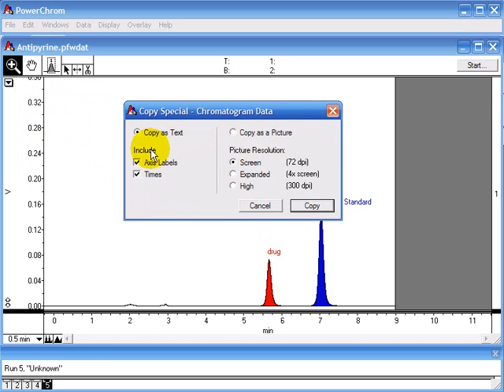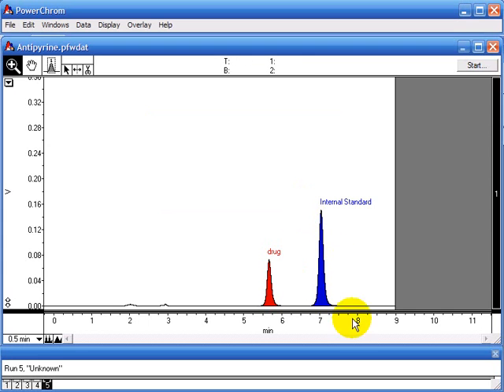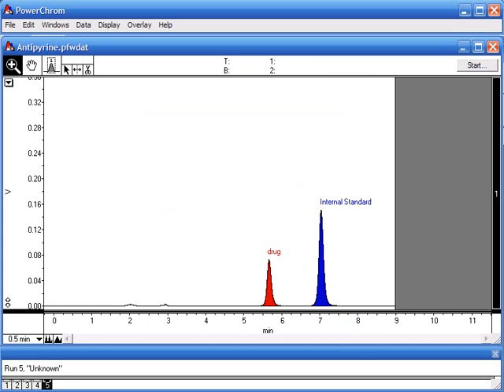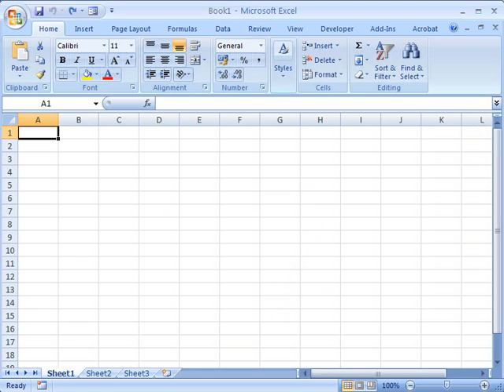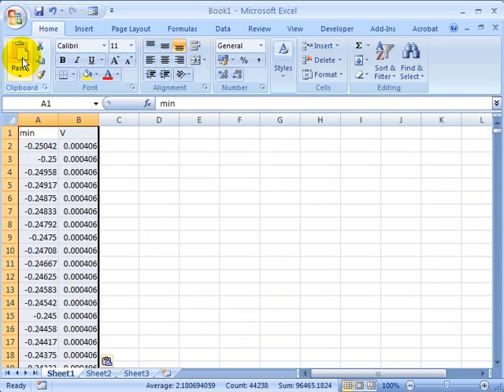If you copy as text, you can include the axis labels and the times. Click on Copy and then open up a spreadsheet like Excel. Click Paste and that will paste in the values, so this is time and the voltage.